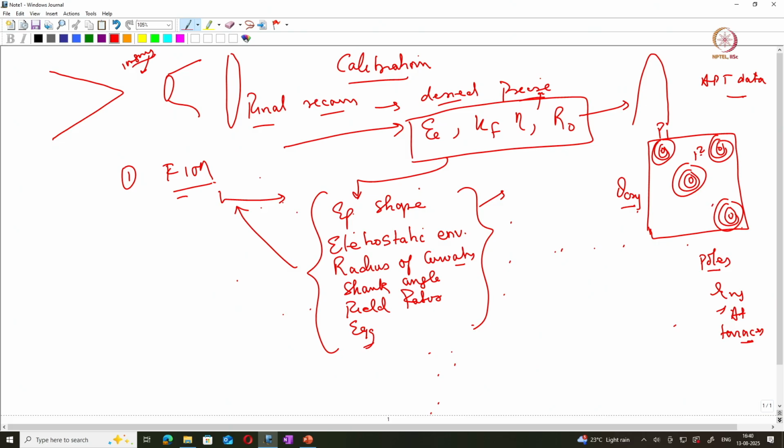Now in the experiment you can also measure this theta observed. Then you will get the image compression factor estimate as theta crystallography divided by theta observed. This way we can identify the xi, or the image compression factor. So this is the first one, the image compression factor.